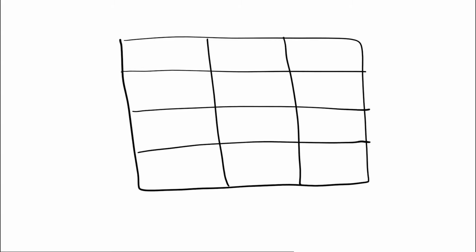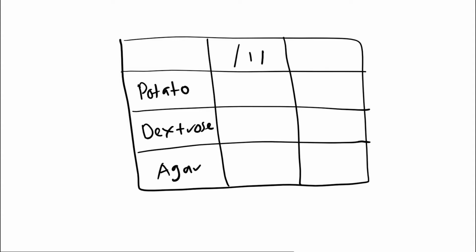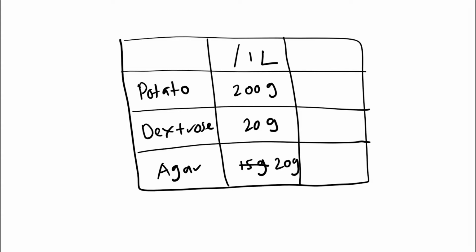As mentioned earlier, the PDA consists of potato, dextrose and agar. For preparation of 1 liter of the media, we need 200 grams of fresh potatoes, 20 grams of dextrose or sugar and 15 grams of agar. However, we increase the agar from 15 grams per liter to 20 grams per liter for more solid agar media.